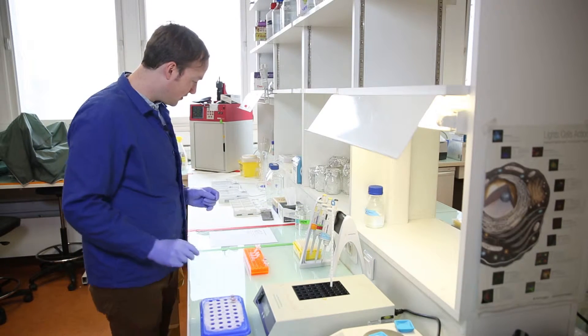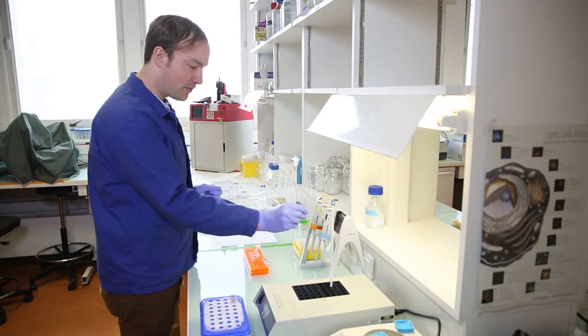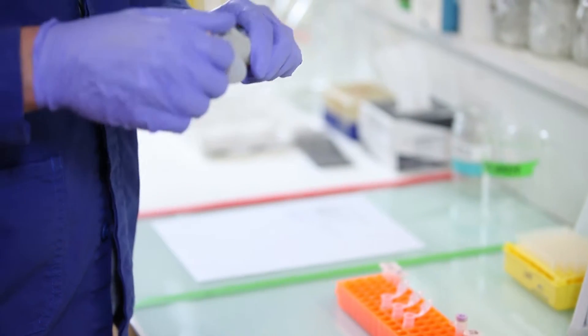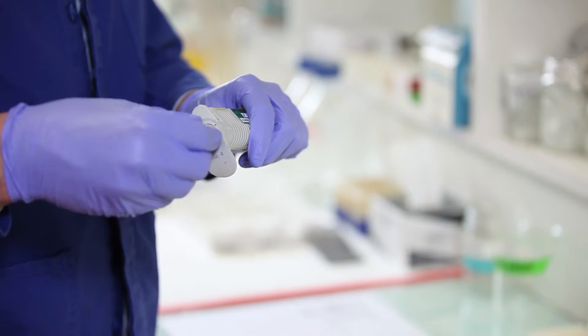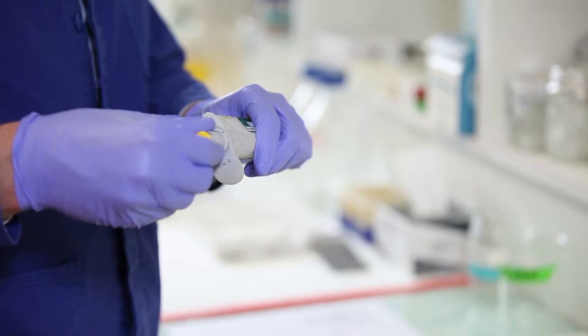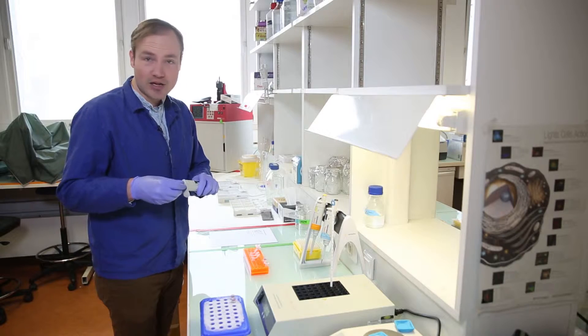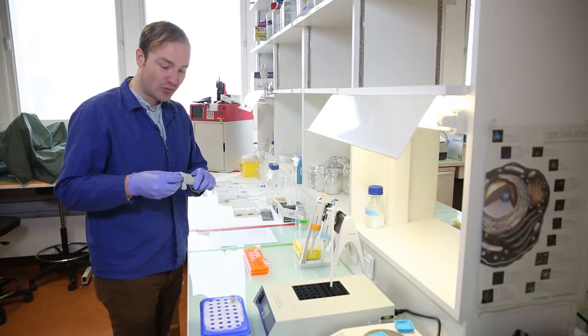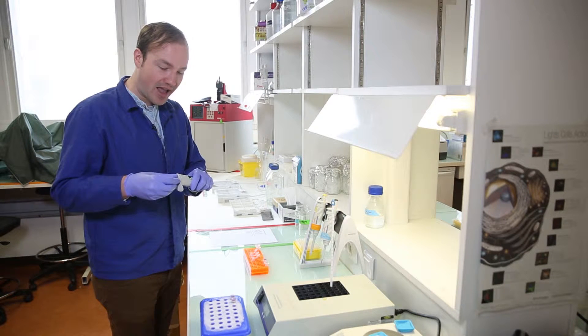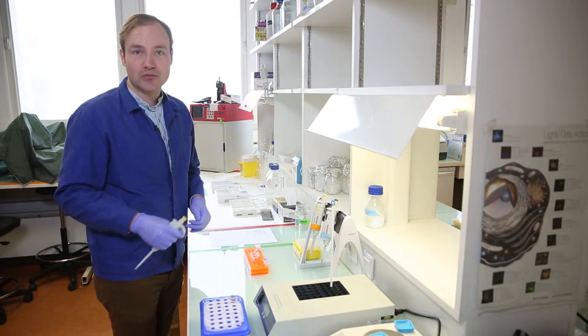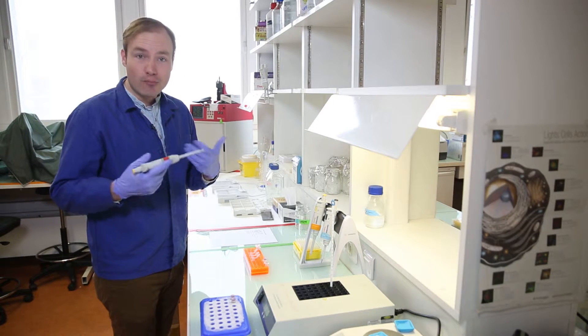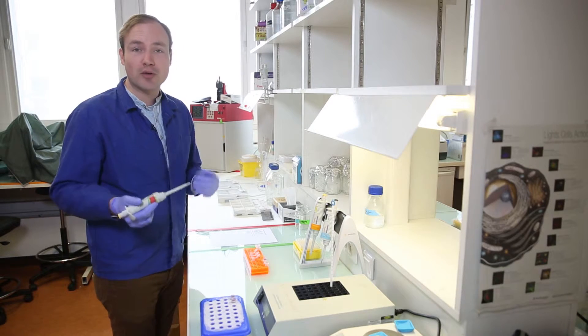Next, 10 microliters of buffer. This is a buffer specific to the restriction enzymes that we'll be using in this digest. Restriction enzyme buffers provide two things: a pH buffer, because most restriction enzymes work best around neutral pH, and they're a source of magnesium ions. Restriction enzymes and most enzymes in biology work much better if they have magnesium ions.